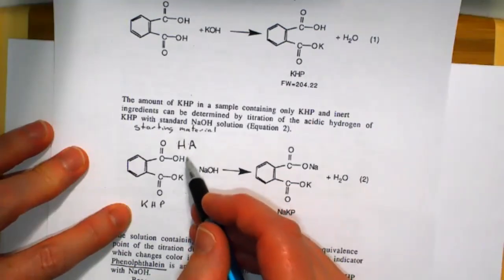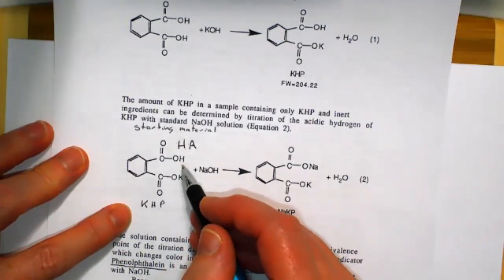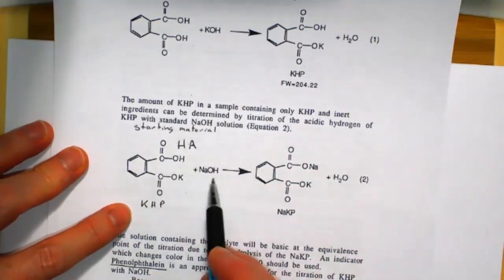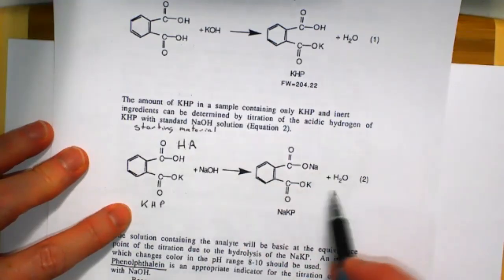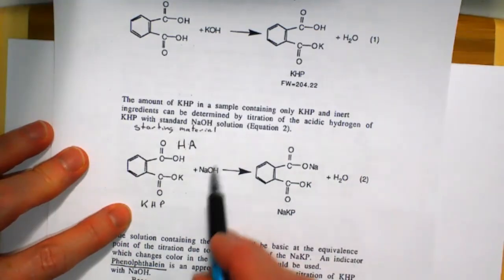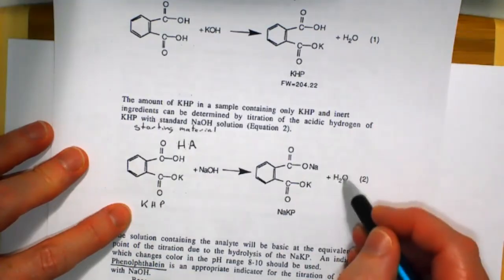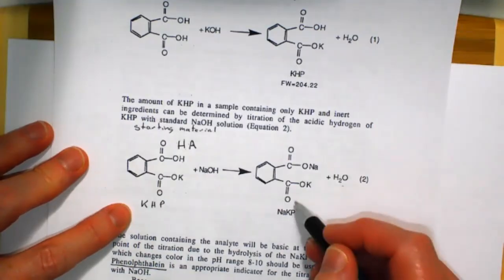The H is the acidic proton that I care about. So when I show it to organic chemists, I say Ha. Okay, so HA reacts with sodium hydroxide, and we end up neutralizing that sodium hydroxide. So very simple, and the results are water and a salt.